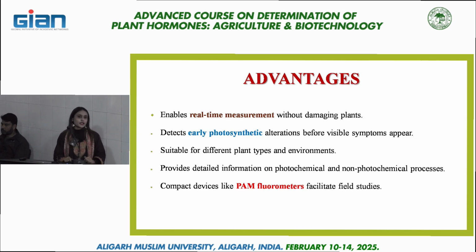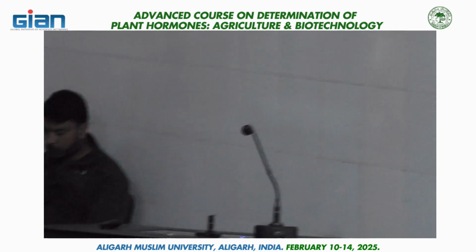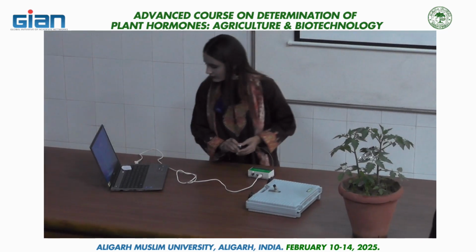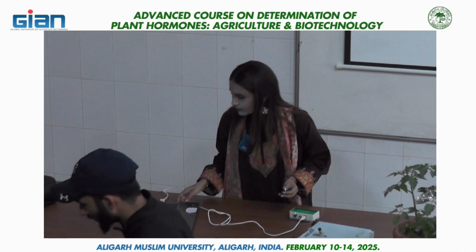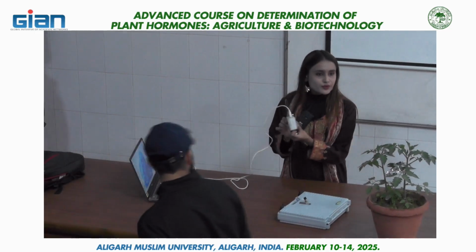Now I am going to tell you how to use it. So basically, this is the Junior PAM.